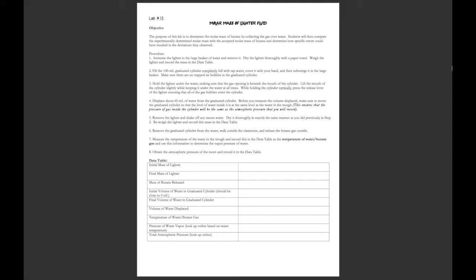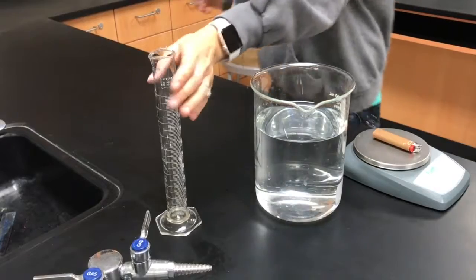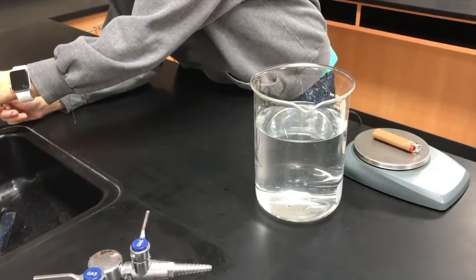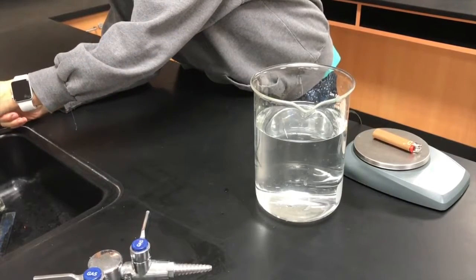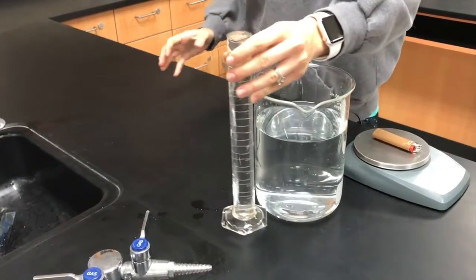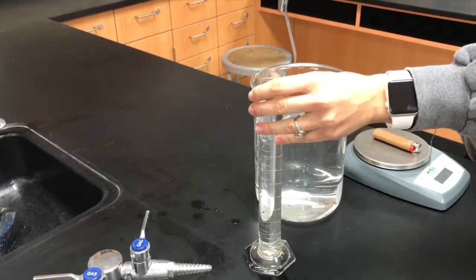Then you're going to fill the 100 ml graduated cylinder completely full with tap water, and you're going to cover it with your hand and then submerge it in the large beaker. Make sure there's no trapped air bubbles in the graduated cylinder. Now I need to fill my graduated cylinder with water. Okay. So notice the graduated cylinder is completely filled with water all the way to the top because I don't want to have any sort of air bubble.